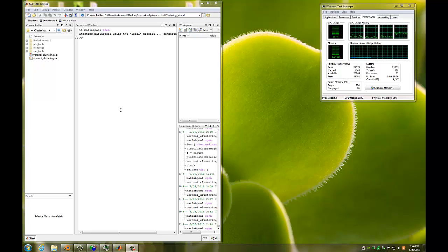What you need to do is open MATLAB, and the first thing you do is type in the command matlabpool open. What that does is start MATLAB instances on the different cores of your computer, so you can make use of multi-coring. In the end, you should see a symbol like this 4-core symbol. In this case, it's a quad-core Xeon processor. It's very important because it means that the analysis is going to be 4 times as fast, and it makes a huge difference, of course. If you've got an 8-core machine, you're luckier, you can run it on 8 cores.